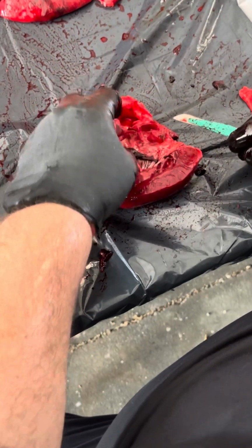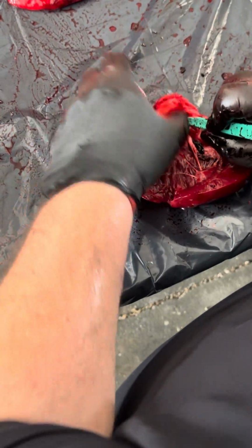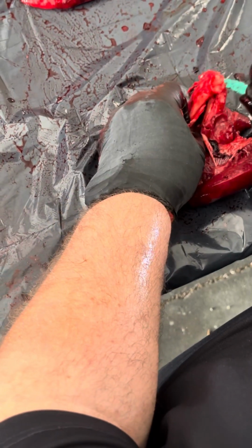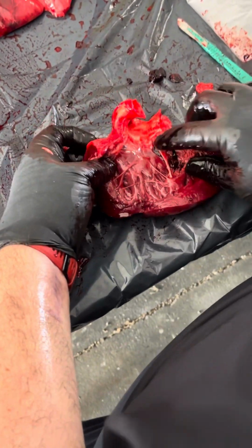Trying to get where I can get a hold of the damn thing. So as I dissect this aortic arch, or aorta, what you have is your semilunar valves, right?